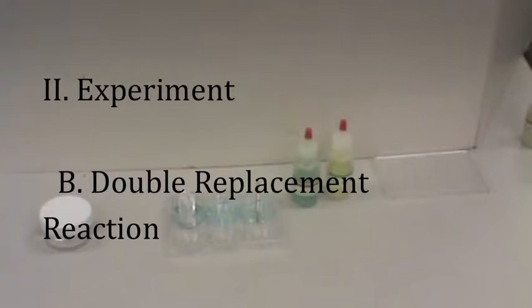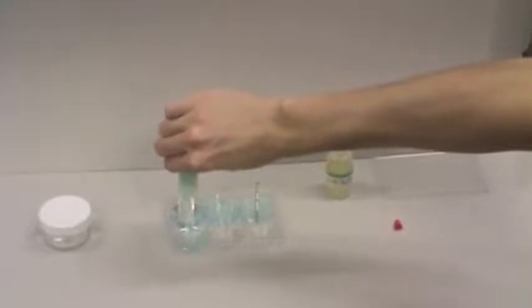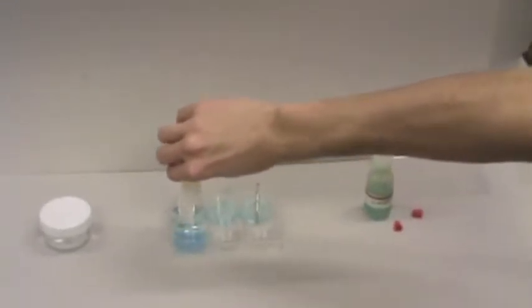Tell students to use well 4. Squirt enough 0.1 molar copper(II) chloride solution so that the well is about 1/4 filled. Squirt the clear 0.1 molar sodium phosphate solution so that the well is now about half filled. Observe the reaction and record results.